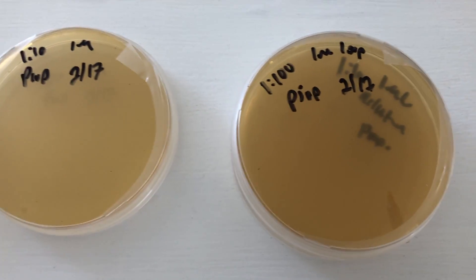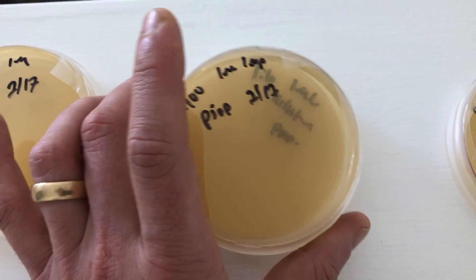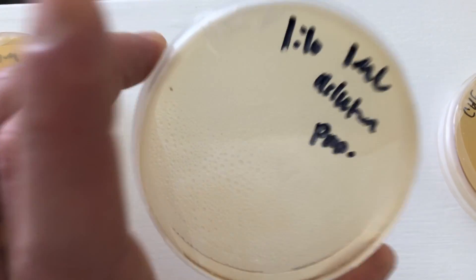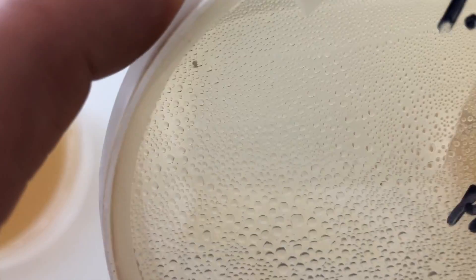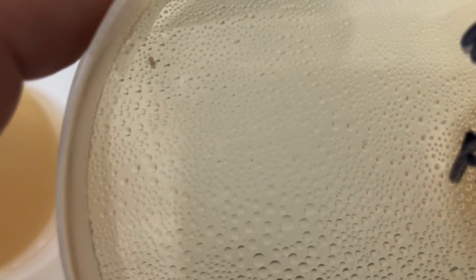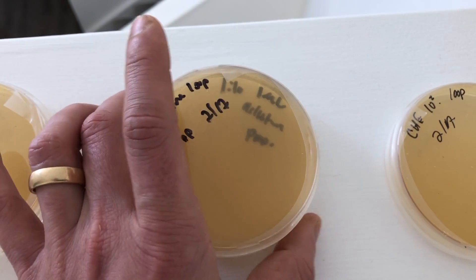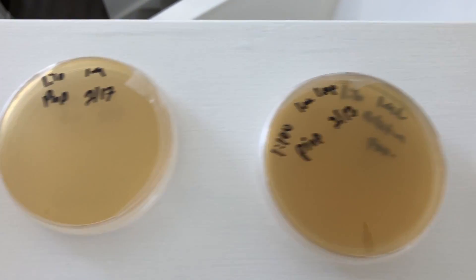As I keep moving on the piapino, we've got our streak plate, and this one at least looks clean. Something going on there, possibly just a particle that got in there, but the streak plates for the piapino are still looking clean.